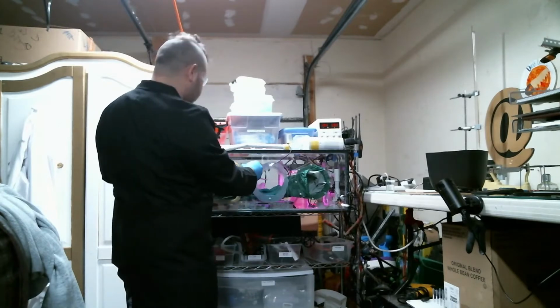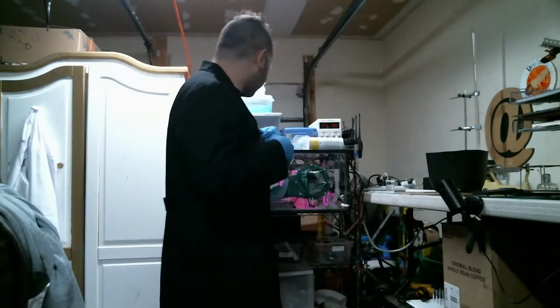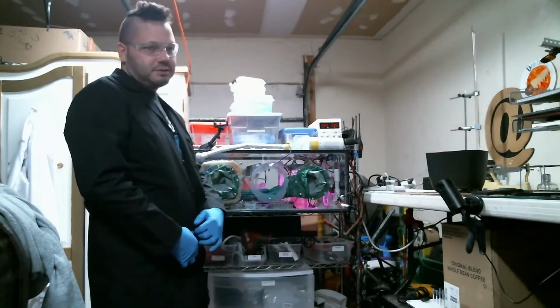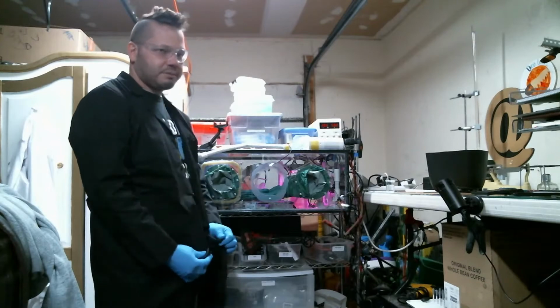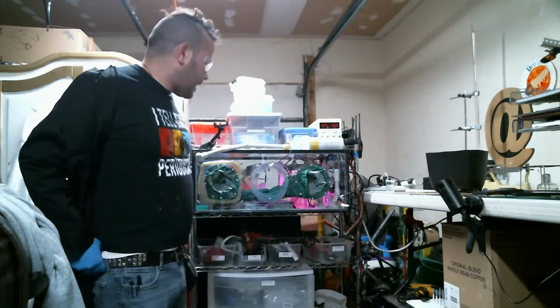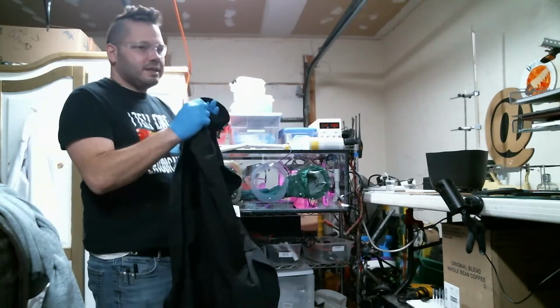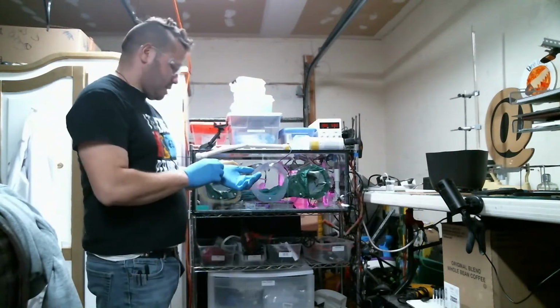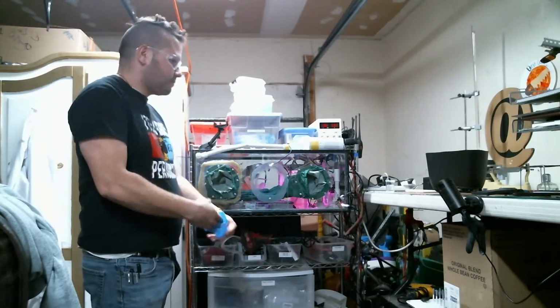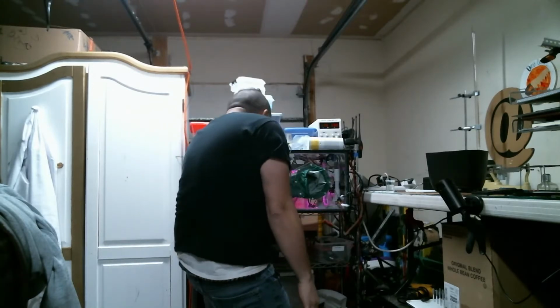So I place it in there and close it up. Now I've got to place it underneath the grow light. To do that, I have to take off my lab coat, because I can't get my hands in the gloves with my lab coat on. Of course, I've got to make sure not to knock everything over in there while I do this.